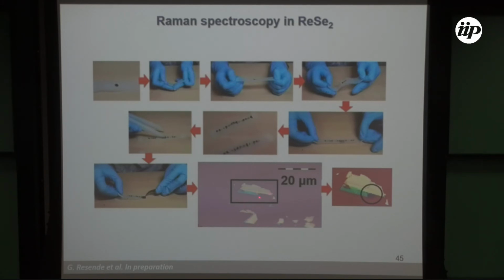So over here, in this point, just a close-up, you can see it is a monolayer. And how did we confirm that? We performed some Raman measurements for the low frequency modes, in this case to characterize and see if it is a monolayer or not.